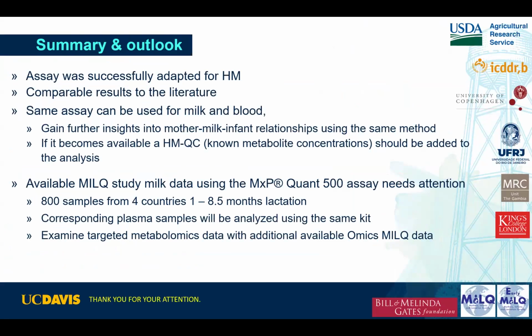So overall, I'd say we were happy that this assay was successfully adapted to human milk, and that we found comparable results to the literature, which just helps to ensure or makes us even feel better about the results we have. What we really like is that we can use the same assay for milk and blood, because we are really looking into mother-milk-infant relationships in our laboratory here.